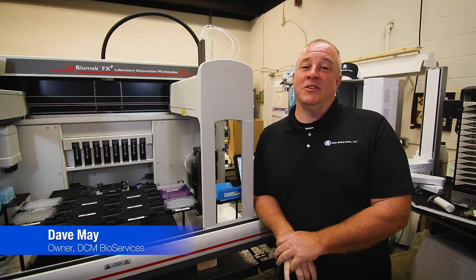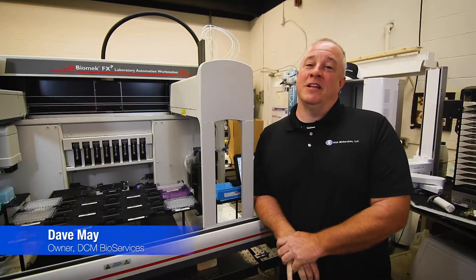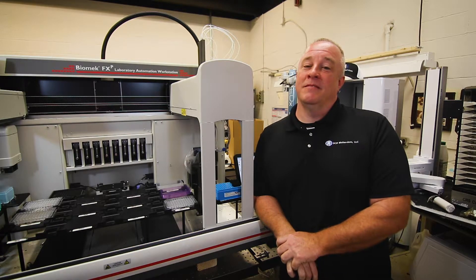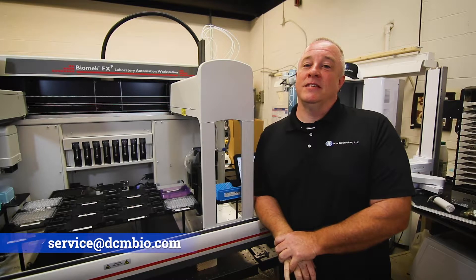Hello, this is Dave from DCMBio Services. Today we're going to be going over how to purge air out of the syringe lines of the Biomex SPAN 8 pod. As always, if you don't feel comfortable performing any of these procedures, please reach out to us at service@DCMBio.com and we'll be happy to assist you.